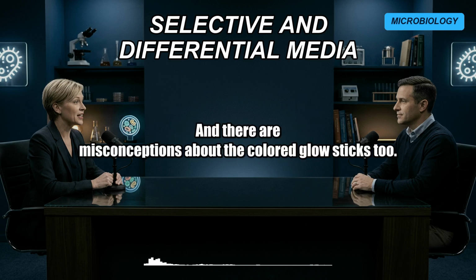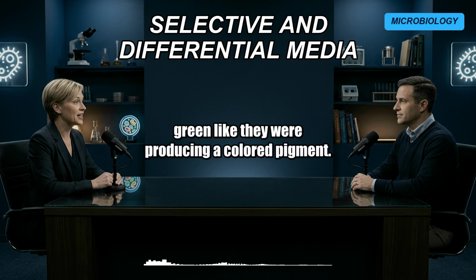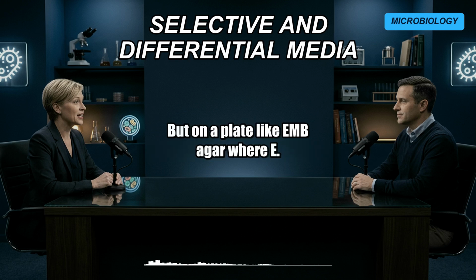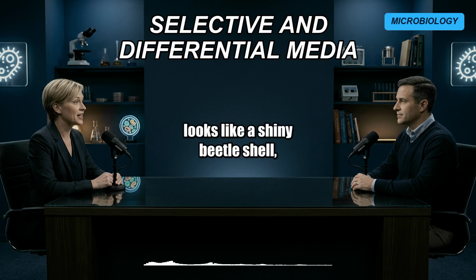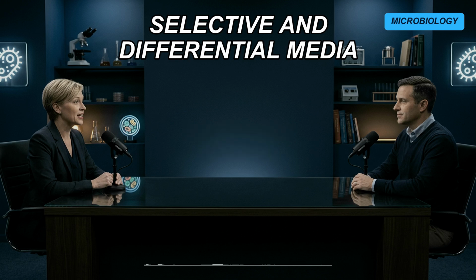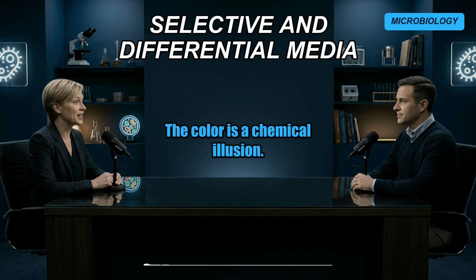Wow. And there are misconceptions about the colored glow sticks, too. I always assumed the bacteria themselves were turning pink or green, like they were producing a colored pigment. Yeah. But on a plate like EMB agar, where E. coli famously grows with this intense metallic green sheen that looks like a shiny beetle shell, the bacteria isn't actually making green paint. Not at all. The color is a chemical illusion. It's a dye and pH artifact.